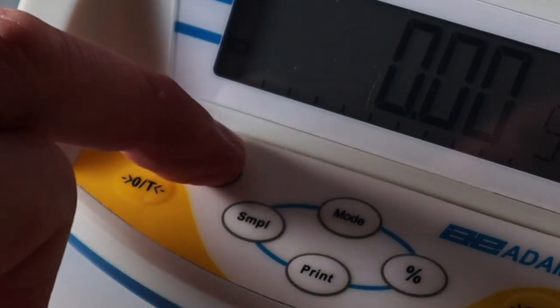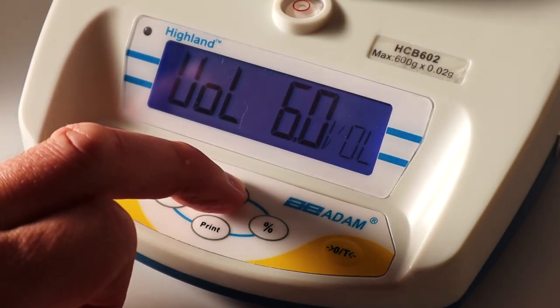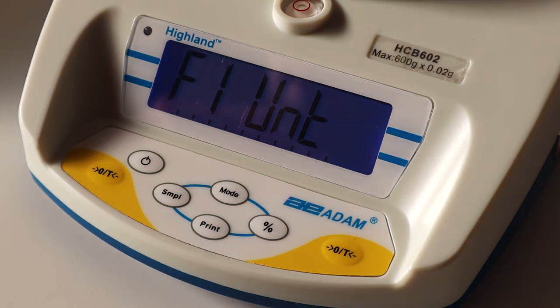For even quicker adding up of weights, you can use Automatic Accumulation, which can be accessed by pressing Mode when switching the Highland on. This menu provides access to many other functions, such as print parameters and external calibration.